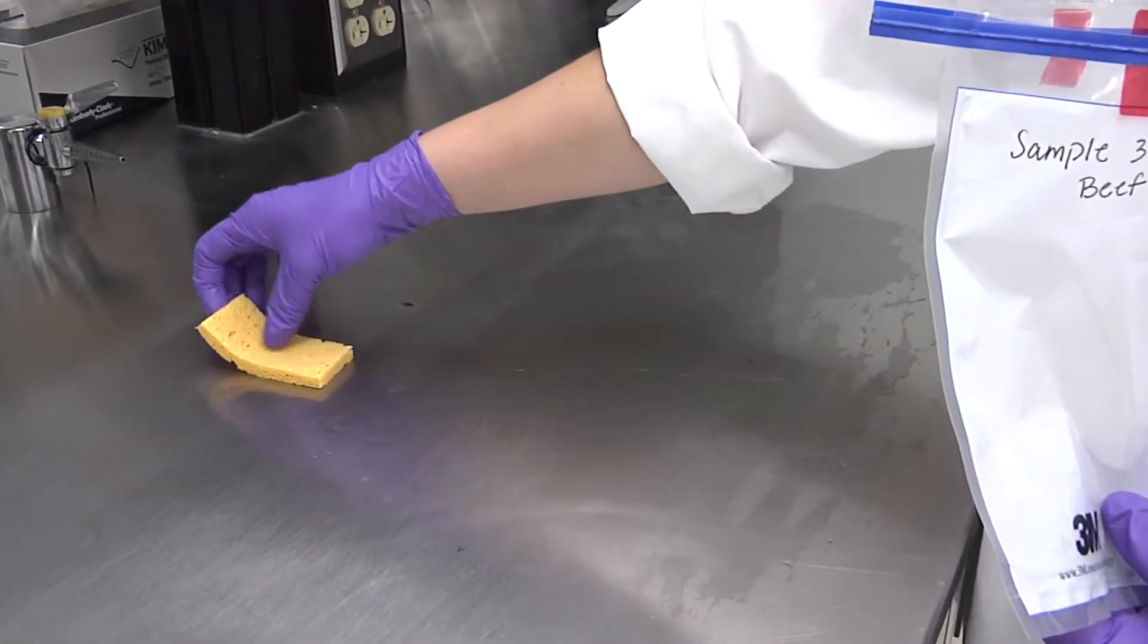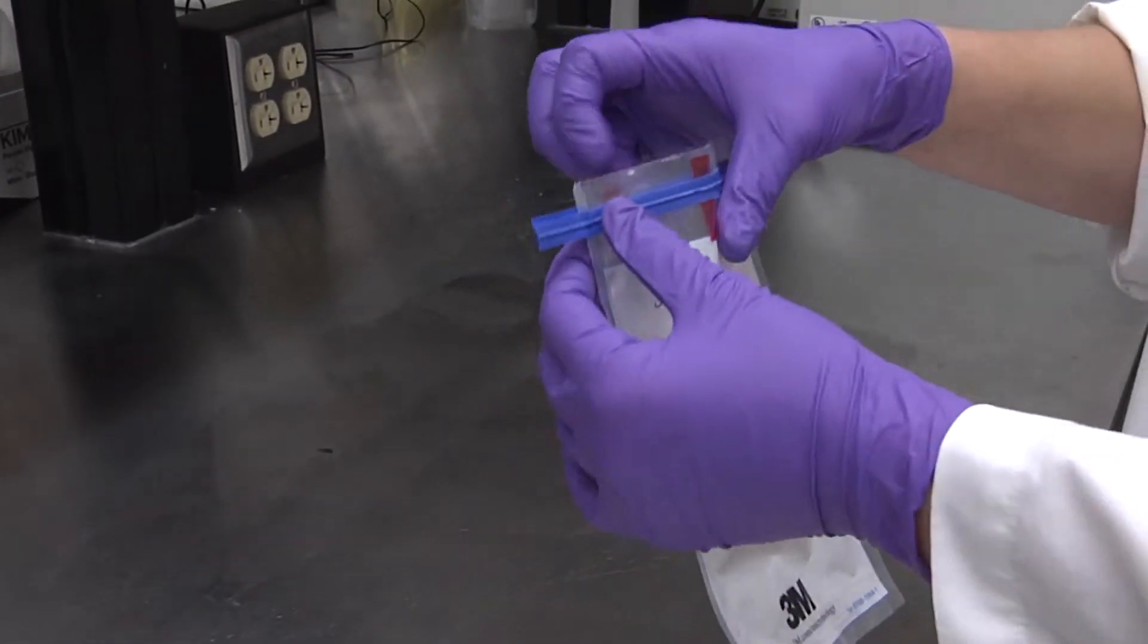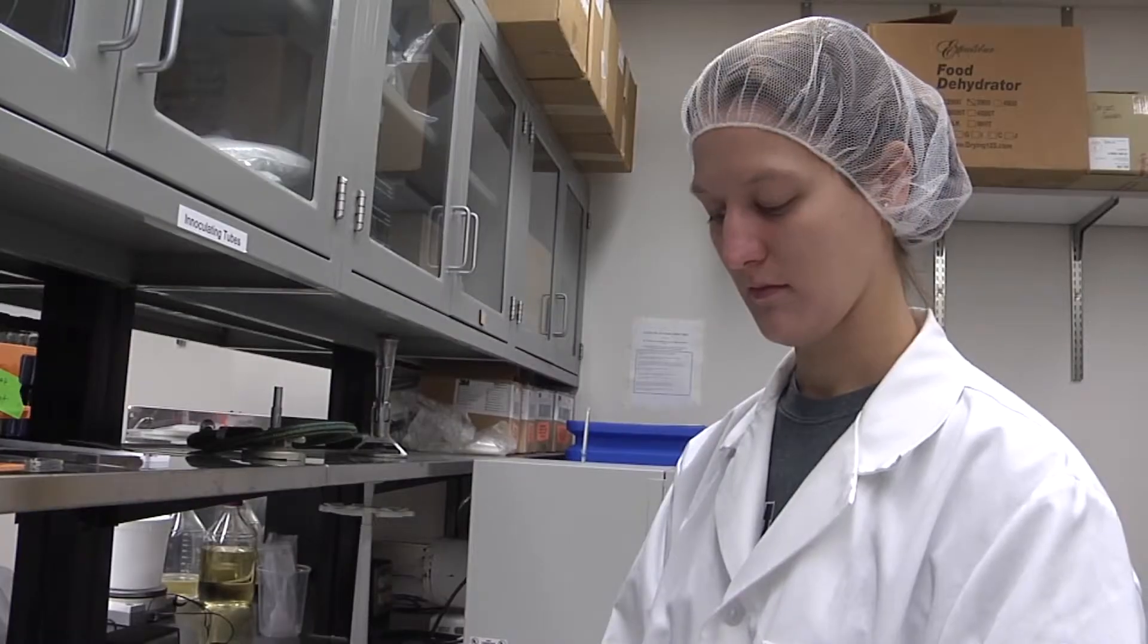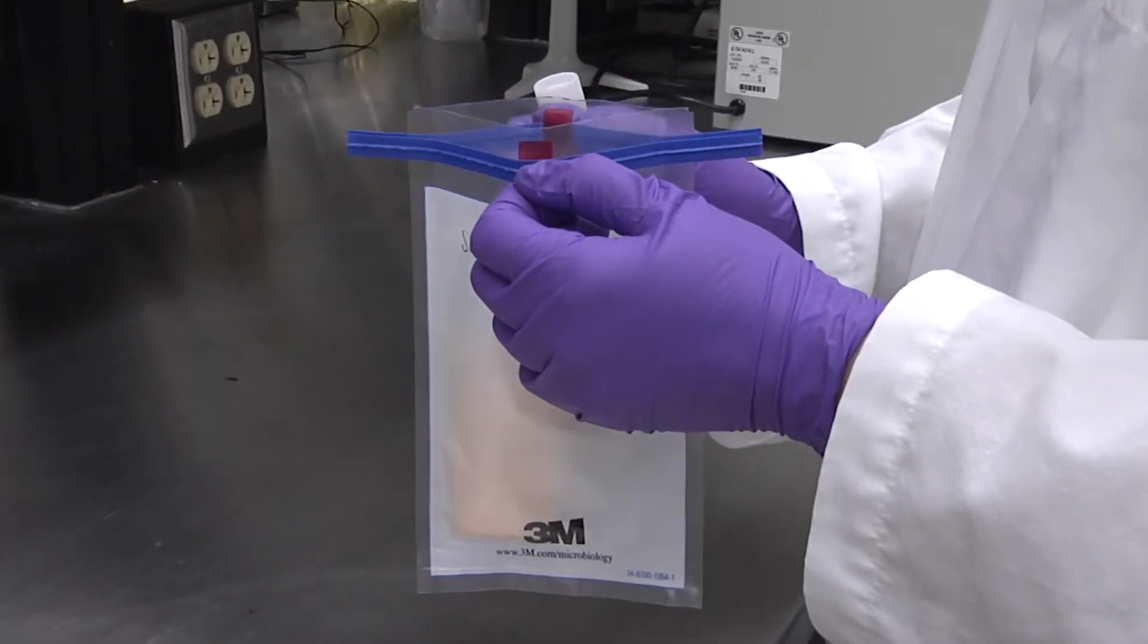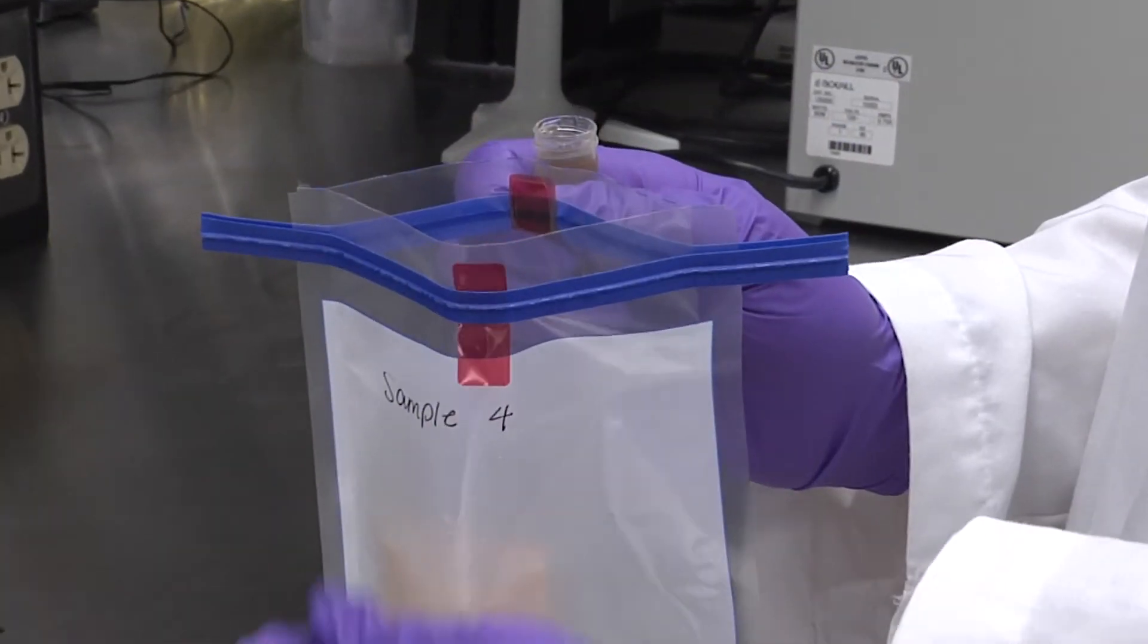When completed, place the sponge back into the same bag. Mark the bag with the designated area using the marker. You can also add enrichment broth to the bag after the sponge has been inserted to start the analytical portion of the testing procedure.